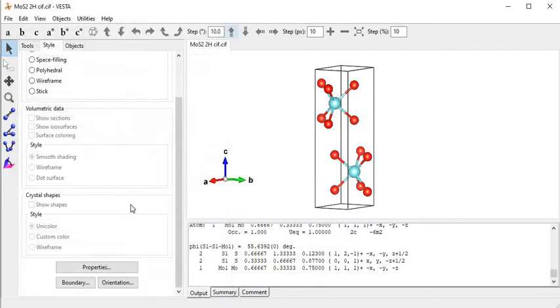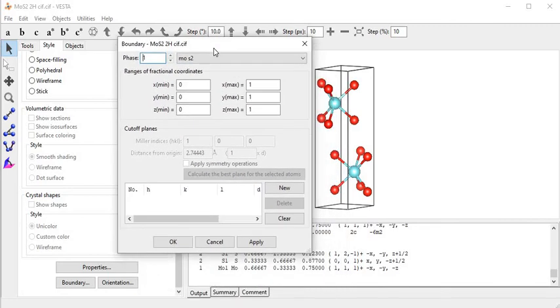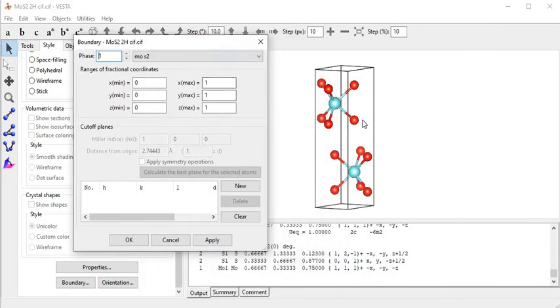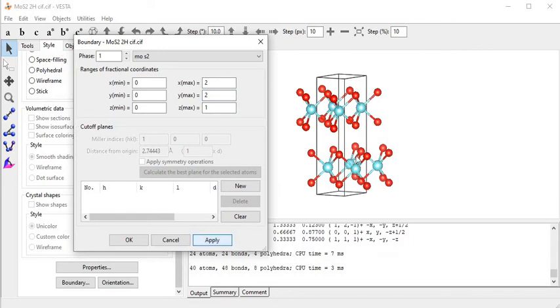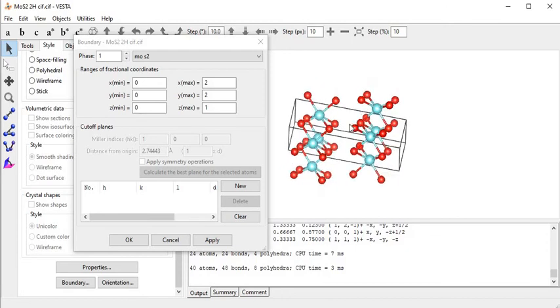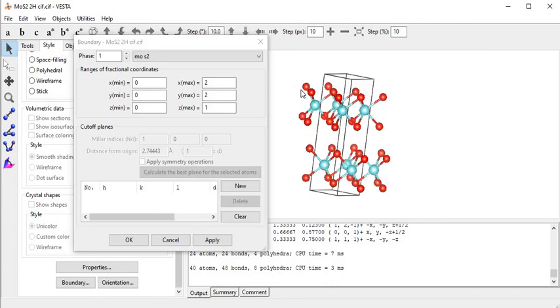Now I close this part and come to Boundary. In the boundary part I can repeat this crystal along x, y, z directions. Let's see - if I set it to two, the crystal is extended two times along the xyz direction. In the y-direction set to two as well, and it extends two times in that direction.